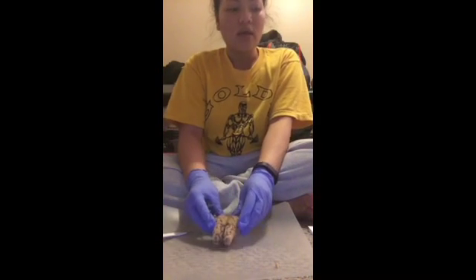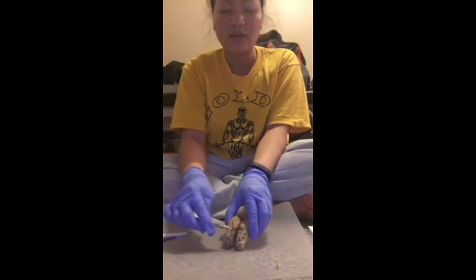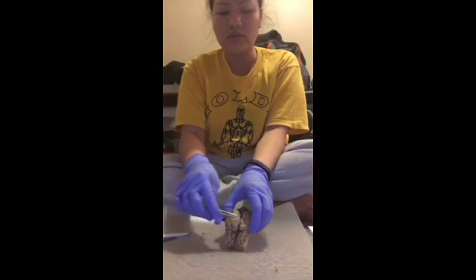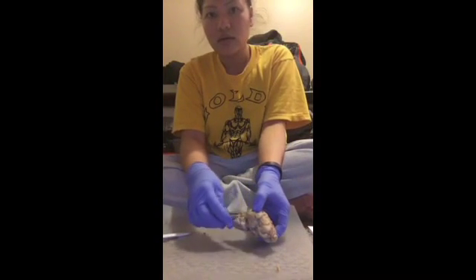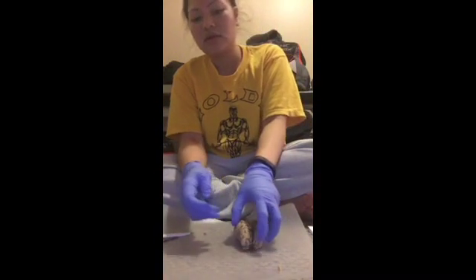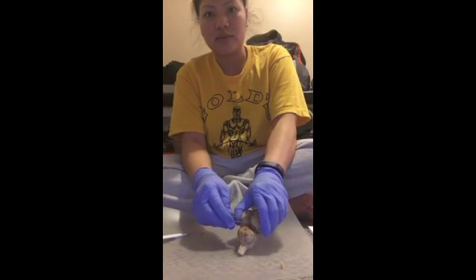humans do. This is the frontal lobe right here. This is the parietal lobe right here. These two. The temporal lobe is located right here. This is the temporal lobe. The occipital lobe is right here behind. That's the occipital lobe.